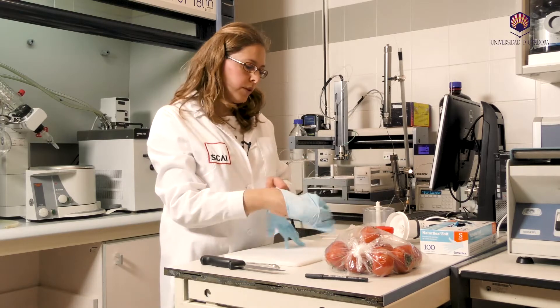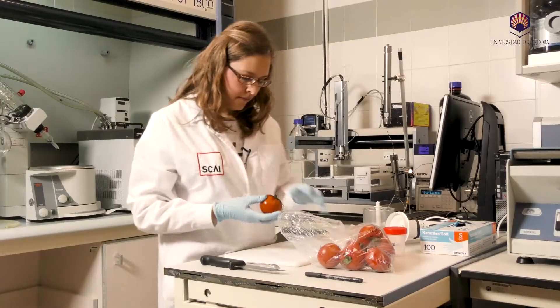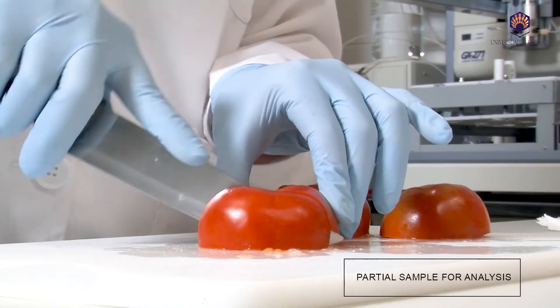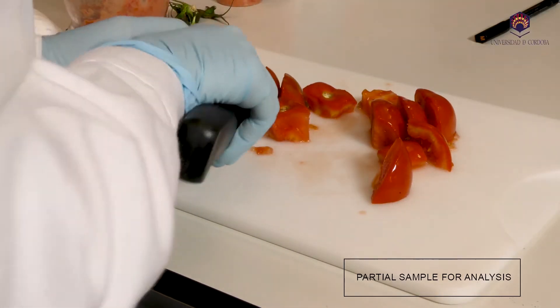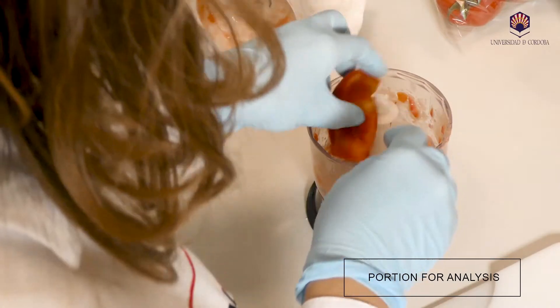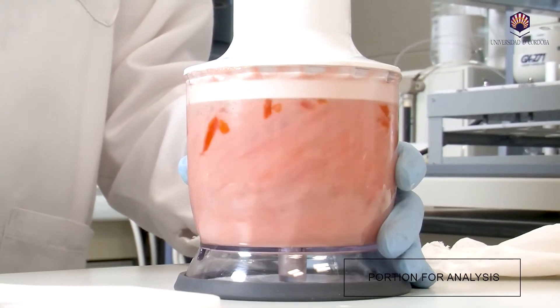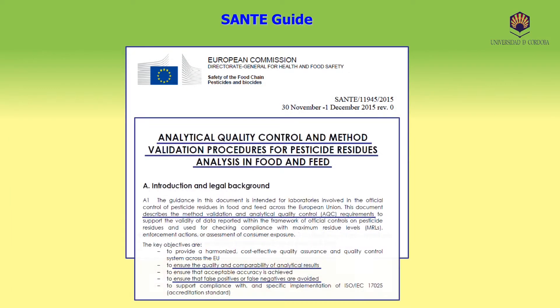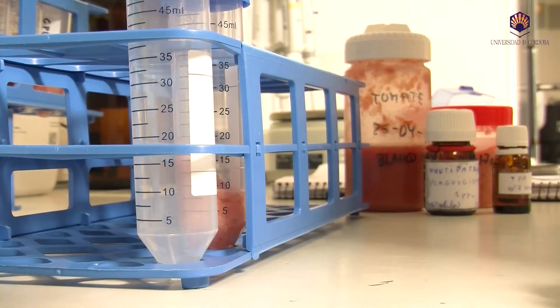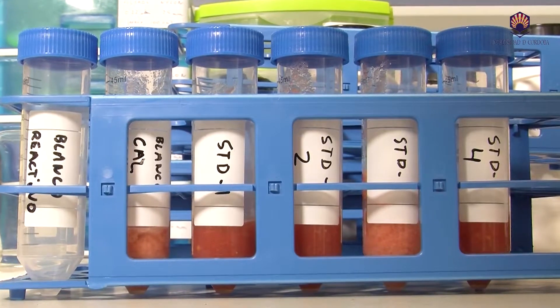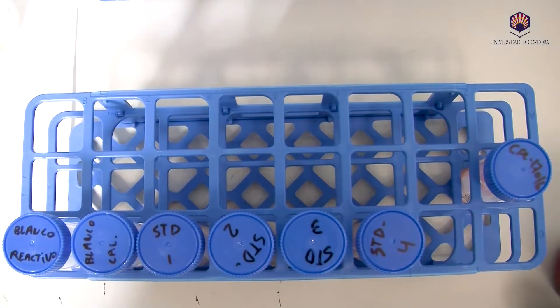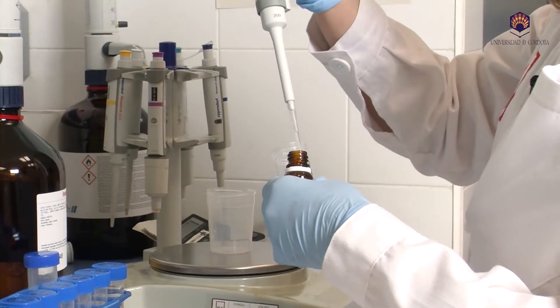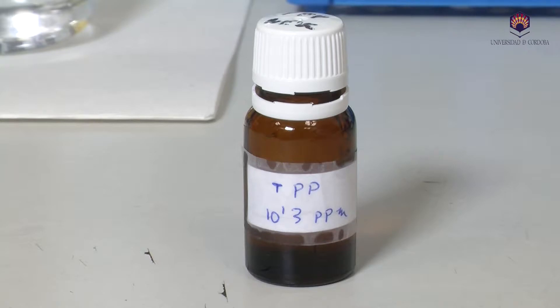When a sample is received in a laboratory, its identification is verified, which is crucial for sample traceability. According to the UNE 15662 standard, the partial sample is first prepared for analysis. It is divided into quarters, and then the portion for analysis is blended for its complete homogenisation. Following the recommendations of the SANTE guide for the quantitative analysis, a reagent blank is prepared — a tube without the sample — as well as standards for calibration in the food matrix, in order to minimise possible chromatographic errors induced by the matrix. Finally, the sample to be analysed is prepared. In all cases, the same concentration of internal standard is added.